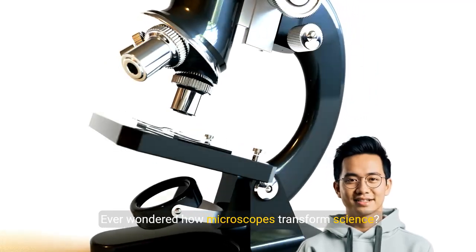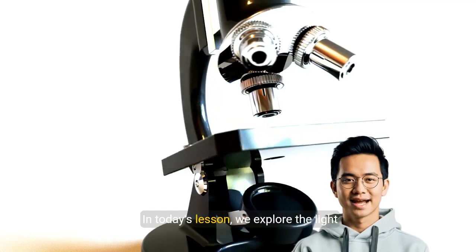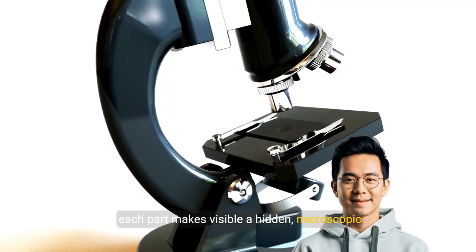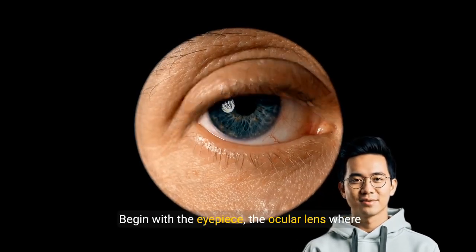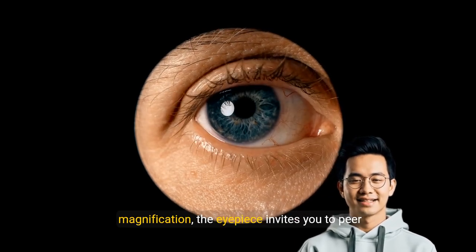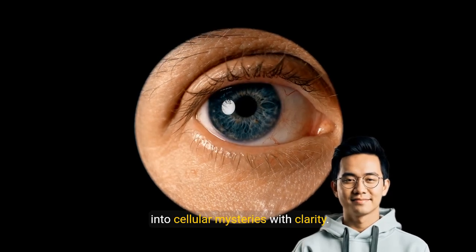Ever wondered how microscopes transform science? In today's lesson, we explore the light microscope's key components and discover how each part makes visible a hidden, microscopic world. Begin with the eyepiece, the ocular lens where your observations start. Typically offering 10x magnification, the eyepiece invites you to peer into cellular mysteries with clarity.